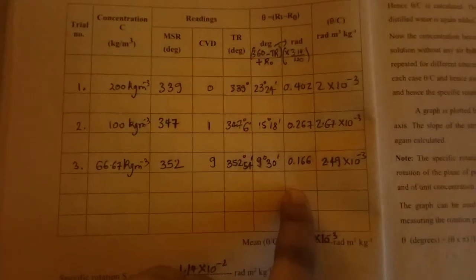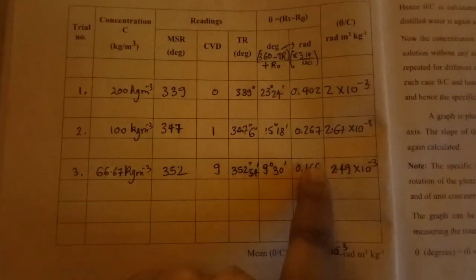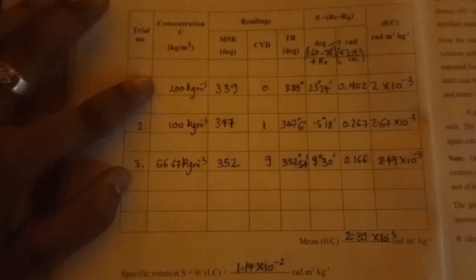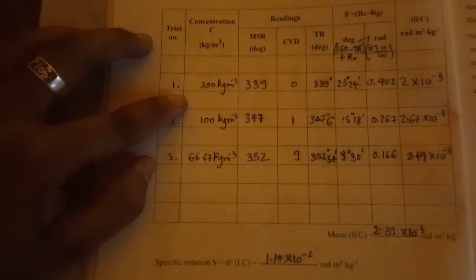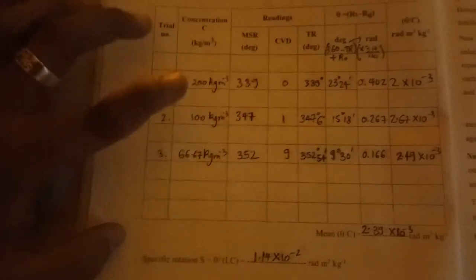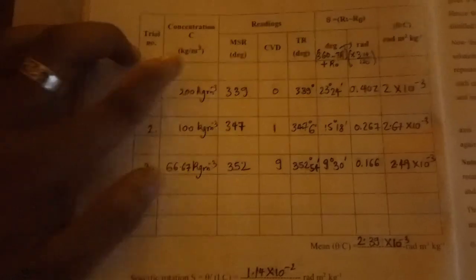Or since you'll be using a calculator, you can directly input it. And once that is done, once you have the radiance values. And like I said, firstly we did this with 200 kg per meter cube concentration. But once that is done, you will be emptying it back into the beaker and diluting it by adding another 25 centimeter cube of water and filling this new solution into the tube, which will now be of 100 kg per meter cube concentration. And again repeat the same process.